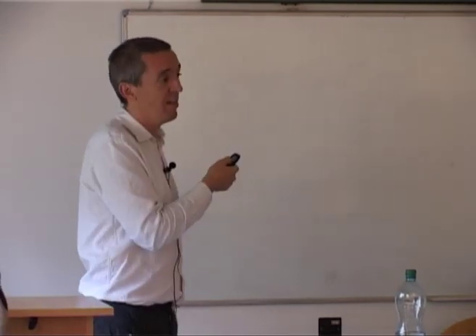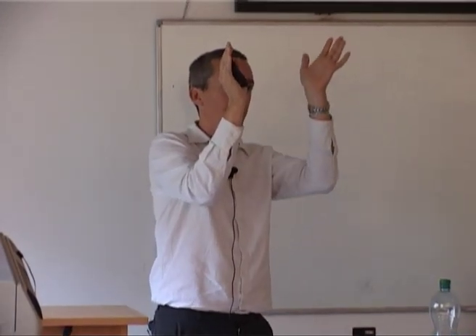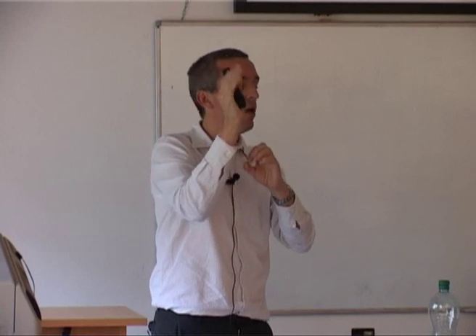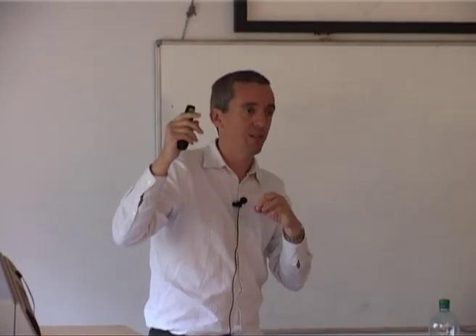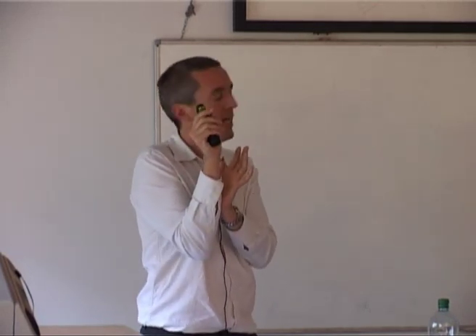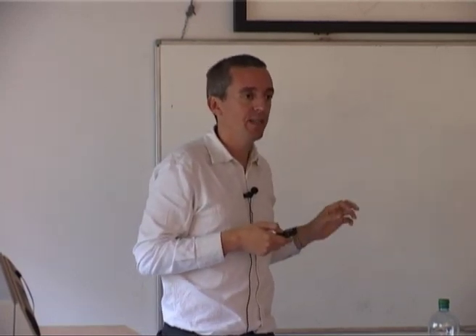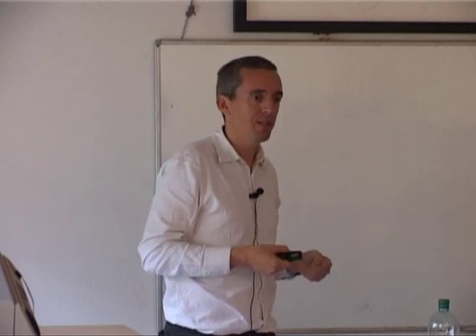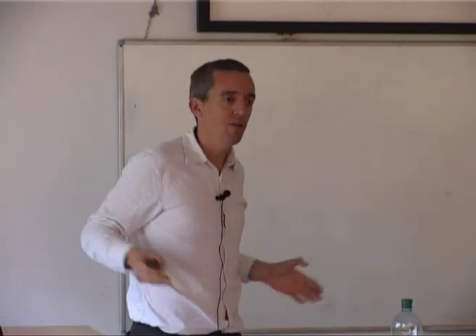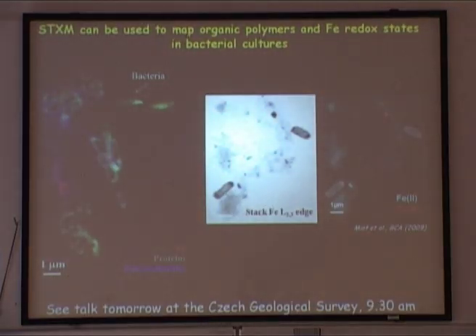The funny thing is that the cyanobacteria I've shown you are very deep branching in the tree of cyanobacteria. Their ancestor was older than the chloroplast, for example. So they branch very close to the ancestor. The idea is that maybe the ancient cyanobacteria used to produce intracellular precipitates. And so there's no way you can find the ancestor of cyanobacteria as extracellularly calcified cells. So that's what I want to finish with.